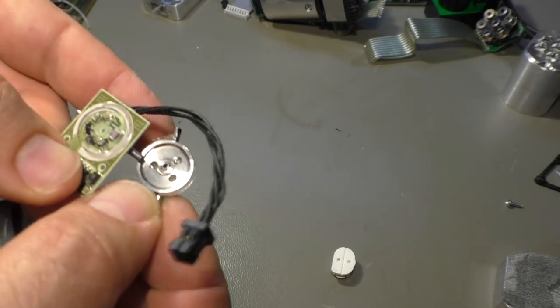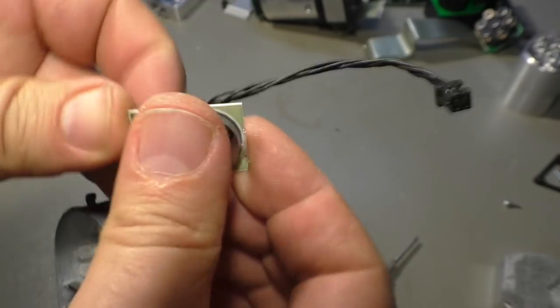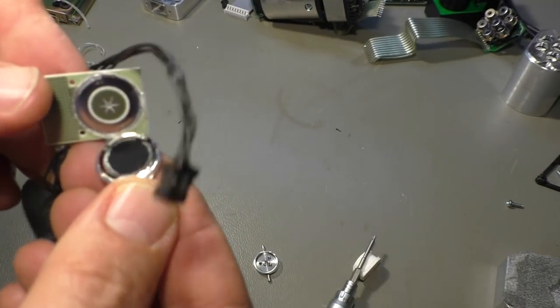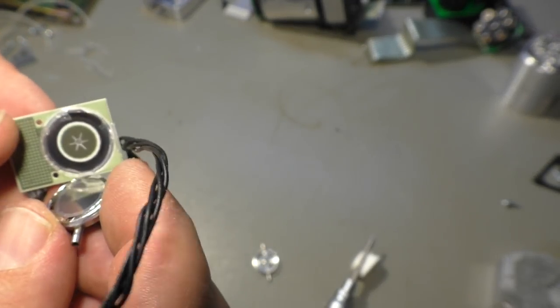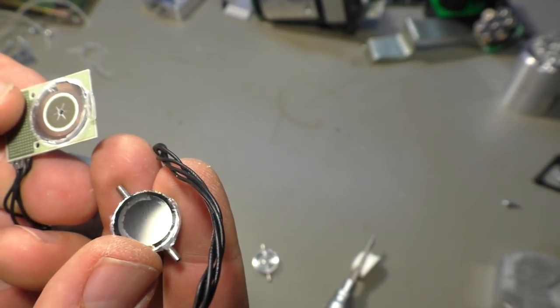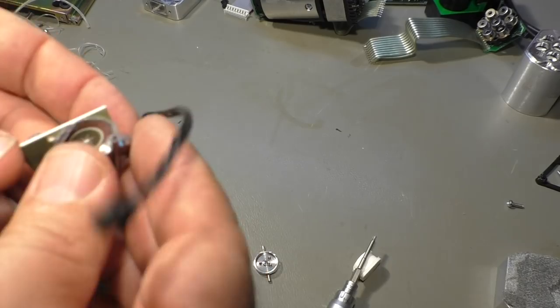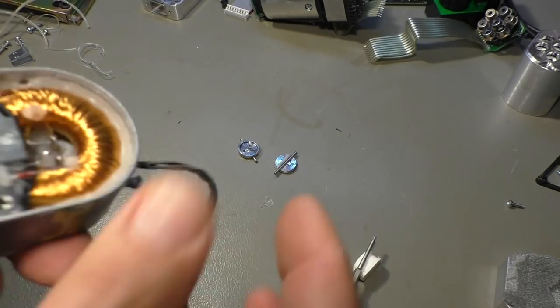It's filled with some schmoo, and there are some electronic components inside, and that's one of the few times I have absolutely no idea what's happening. So that looks like a membrane here, that part, and the other part, it could be some kind of a condenser microphone. So the membrane, which seems to be a metal foil, and the electrode here, they form a capacitor which changes when the two elements come together or go apart by the sound waves. Okay, so that's some kind of microphone.